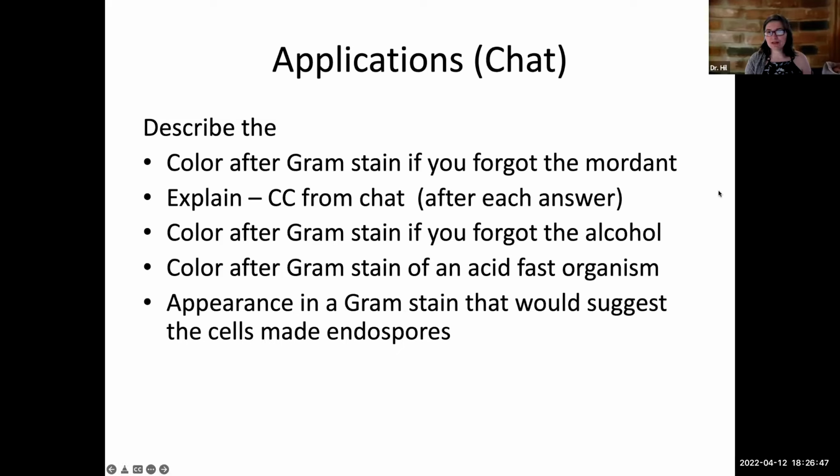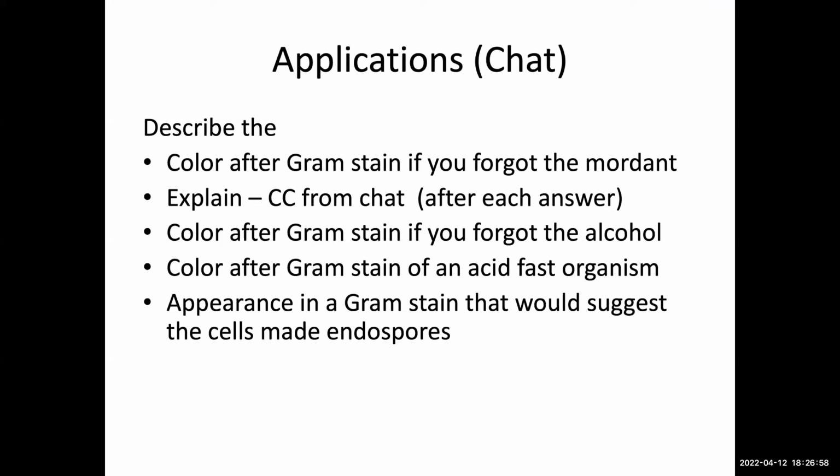Okay, great. So many people put something useful in here. And I think the first person to say it was Haley. Haley said there would be clear spots in the cell. Haley, can you tell us more about that? Yeah, so I was thinking about how those endospores don't take up dye. They're resistant to the dye without the right treatment. So on a Gram stain, they'd probably be clear.